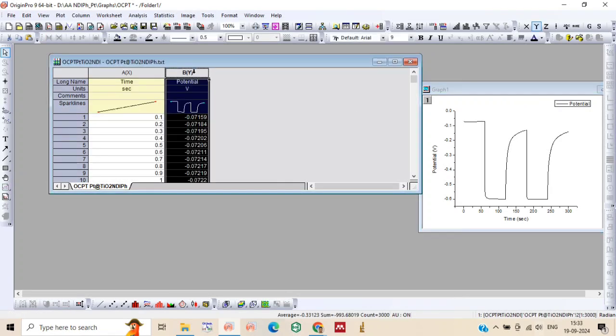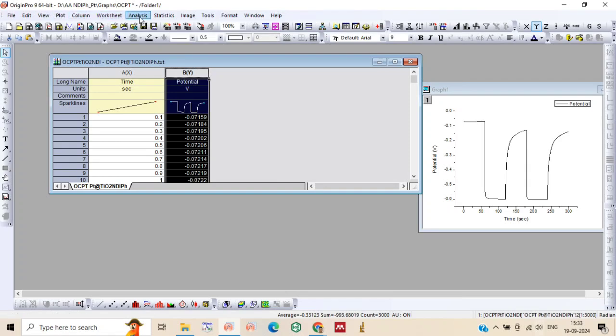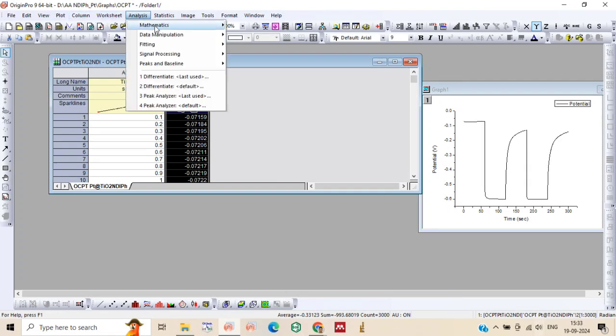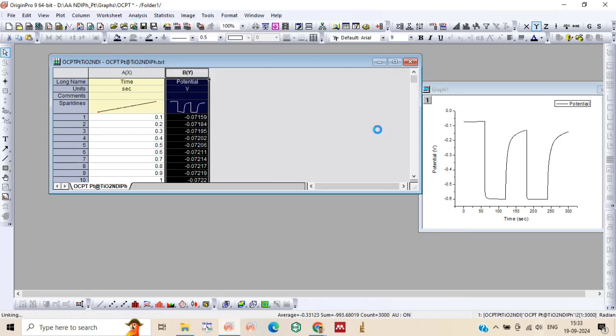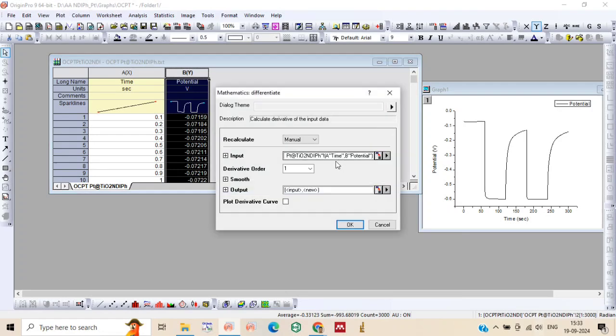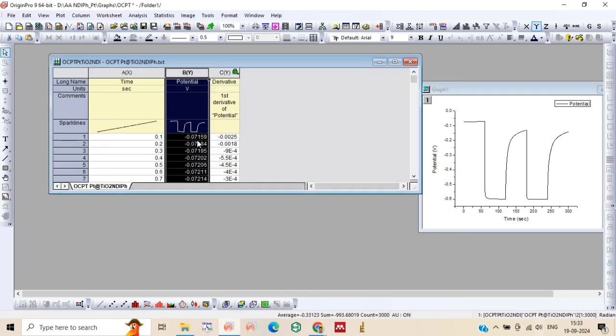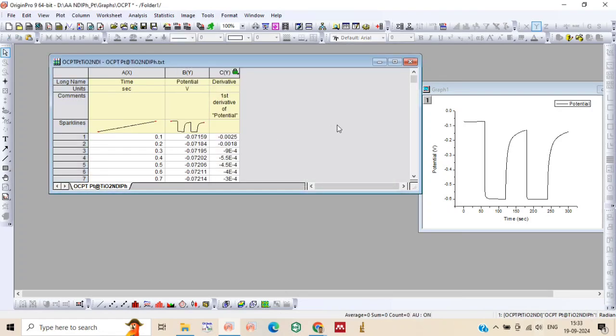Now just select the column B and we will take the first derivative of the column B. So after opening this dialog box, just see there is a derivative order 1. You will get the column C.